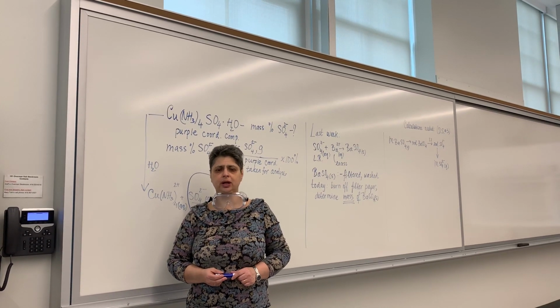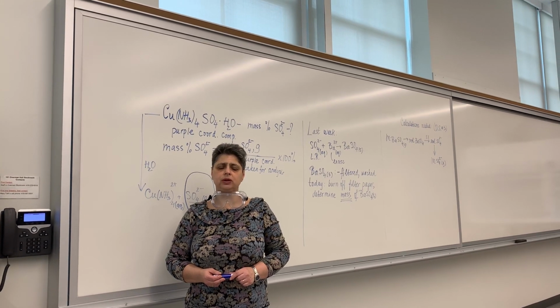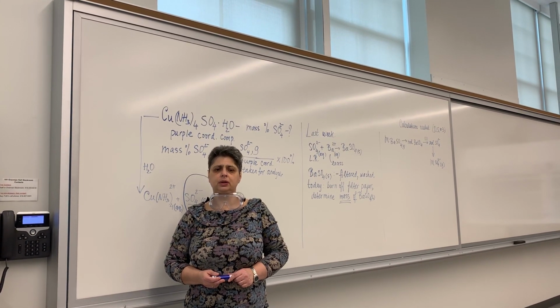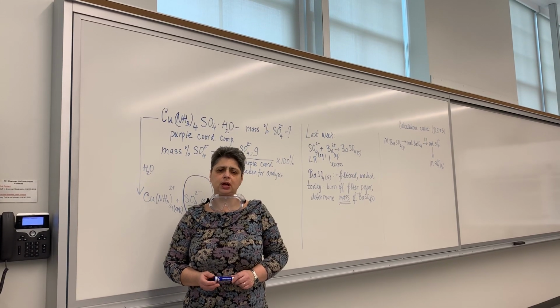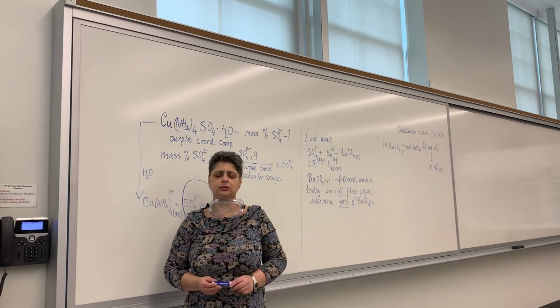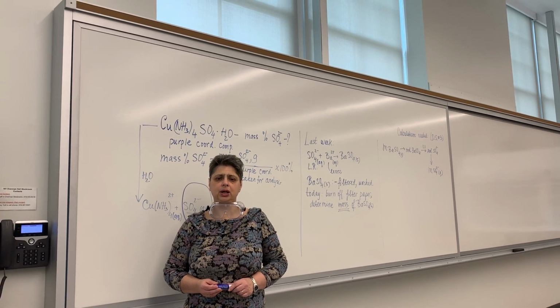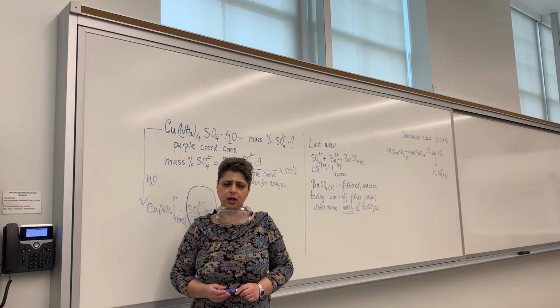Hopefully by now you've had an opportunity to read the procedure and watch the videos that covered the initial portions of that experiment. So today we'll finish up and I will explain what you need to have done to complete this entire long project on synthesis and analysis of a coordination compound.